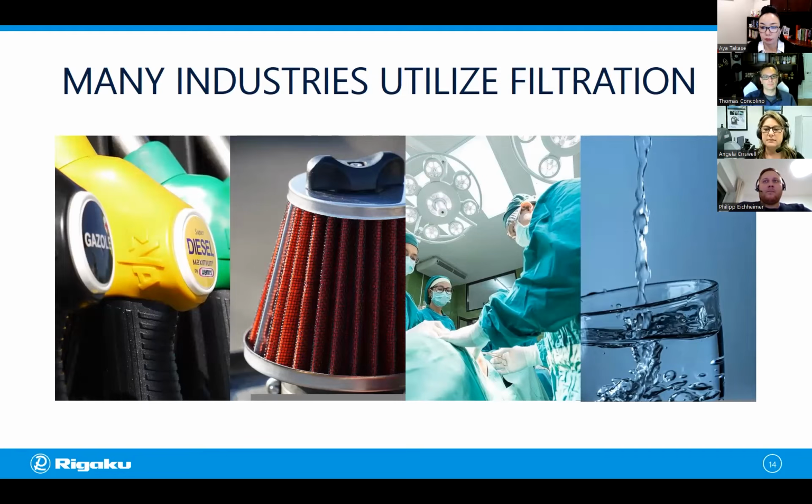And just to give you an idea of the size, the global market for air filter media alone was estimated to be $3.8 billion in 2021. So that should convey to you the huge economic importance of filtration industries for both human health, hygiene, and many other applications. So of course, it would be of interest to many in manufacturing and commercial industries to study filtration.